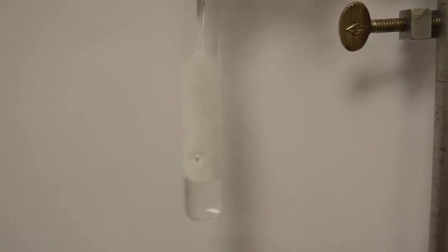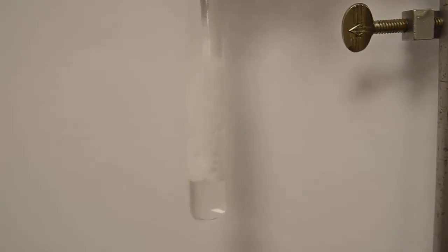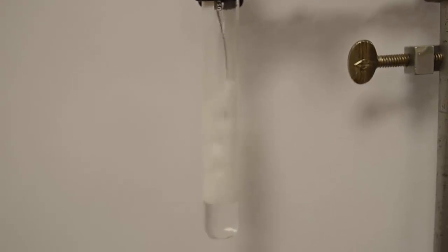I wonder what'll happen if I put magnesium in 6 molar HCl. Let's find out. Wow, would you look at that? A lot of bubbles. I wonder what those bubbles are. I wonder why the magnesium doesn't sink to the bottom. They're just floating on there. Weird. Pretty cool though. Pretty dangerous too.